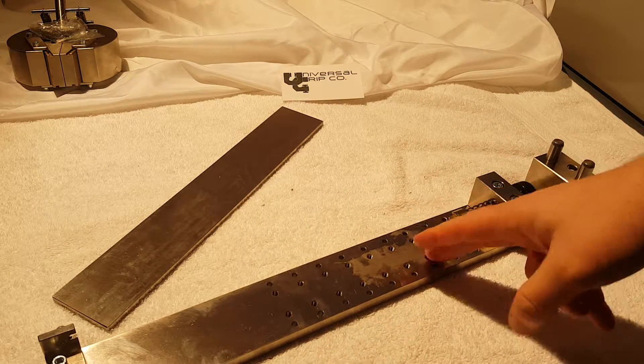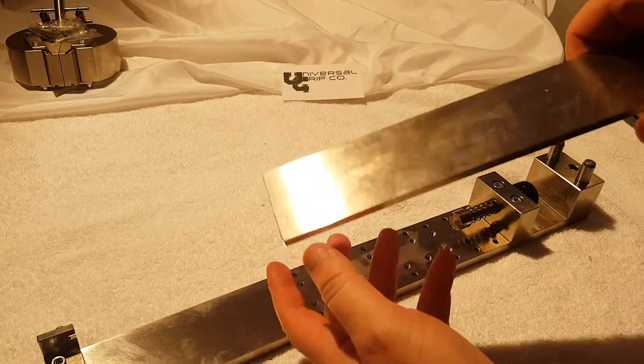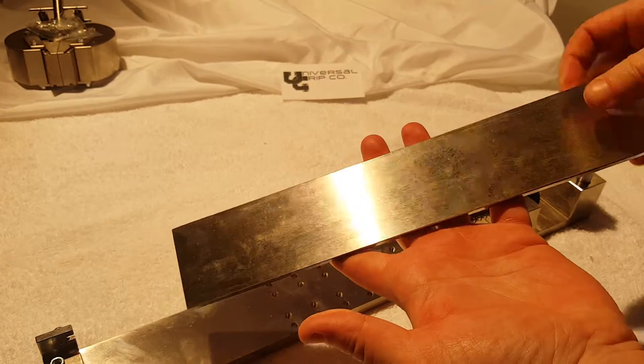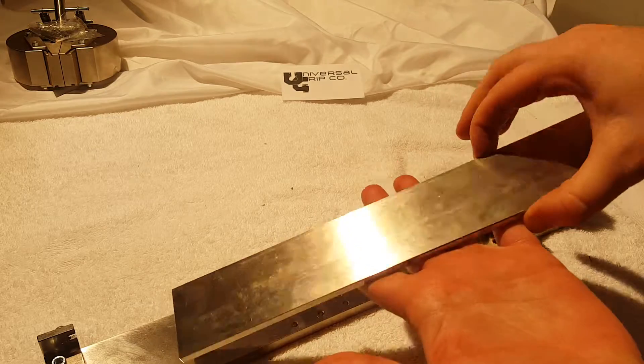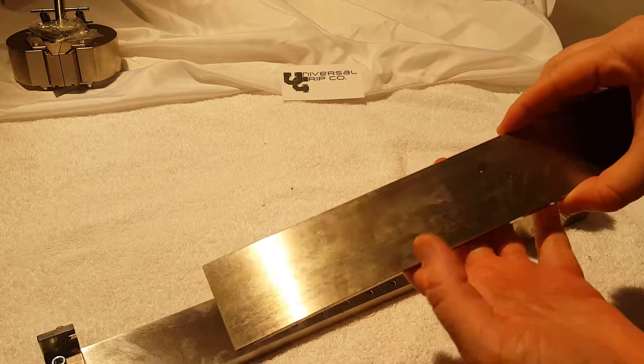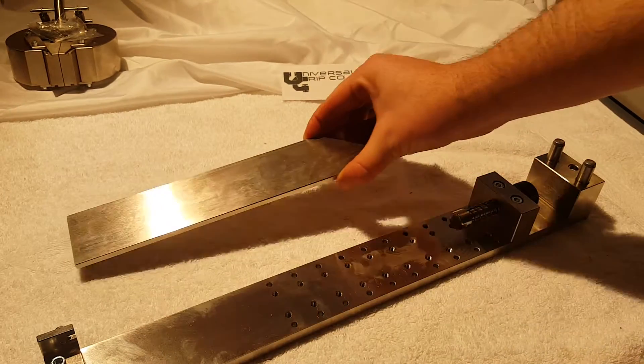So this is the holder, and then this is the stainless steel plate. This one is 60 millimeters in width, so it can test tapes up to two inches in thickness.